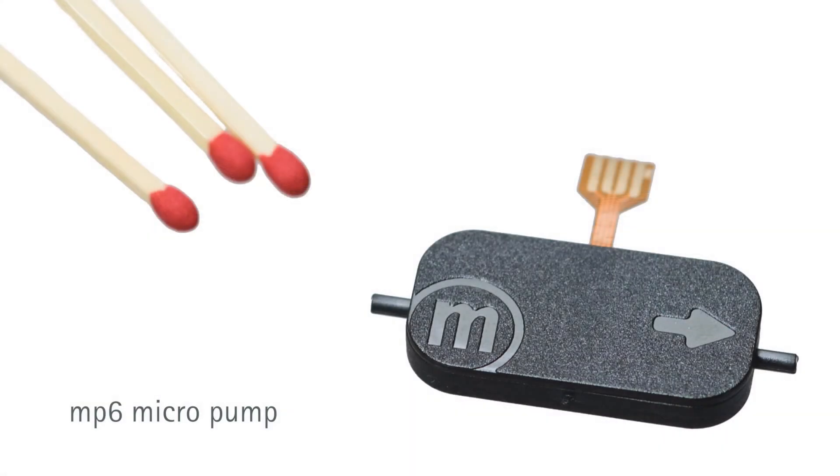Concentrating on the MP6 micropump, its characteristic performance curve shows a maximum flow rate of 7,000 microliters per minute at no back pressure and 600 millibar maximum pressure at no flow rate.